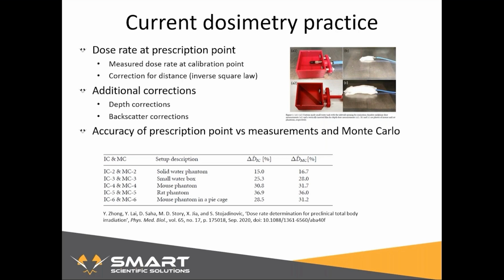And one important thing to notice is that these phantoms, while having a different geometry, are still homogeneous. So it's just one single material. So in reality, the deviations are going to be much larger.